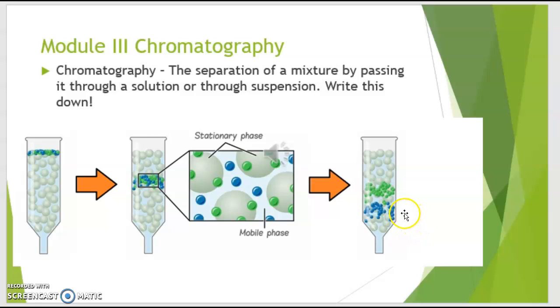What we would do in the lab is take a little UV light and scan it up and down this column chromatography until we see glowing. Whenever we see glowing, that tells us, oh, there's our protein. We can actually visually see where our protein is inside the column, and you would see it drip from the bottom here into a beaker, and it would glow. Whenever you stop seeing the glowing, you would cap this off and not allow anything else to pass through the column, and all of your protein that glows should be in the beaker.